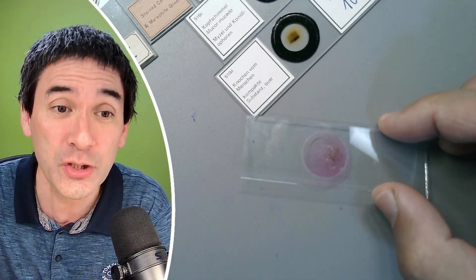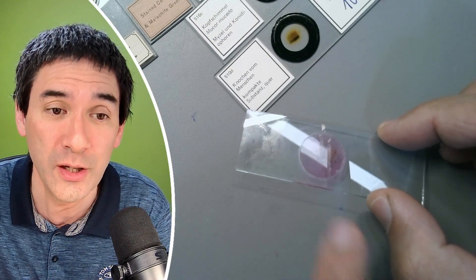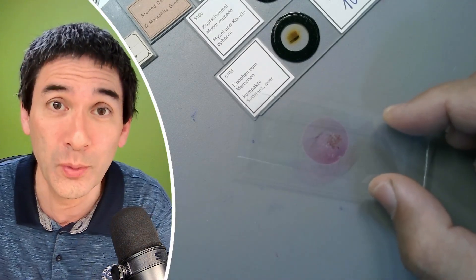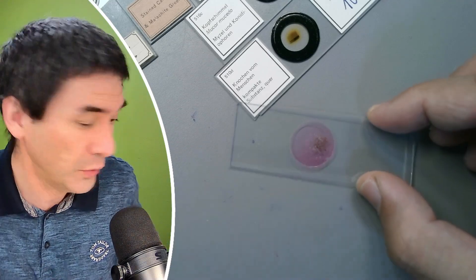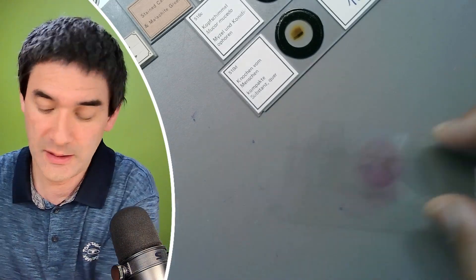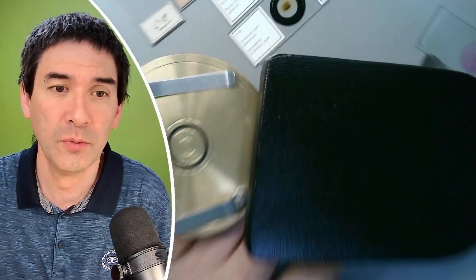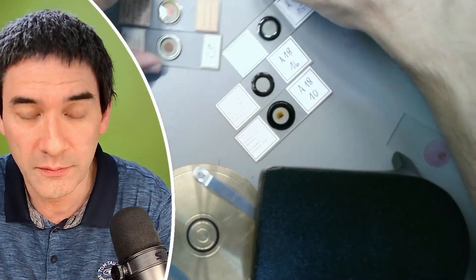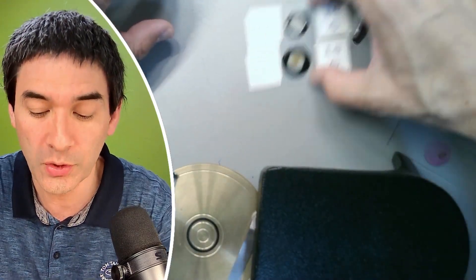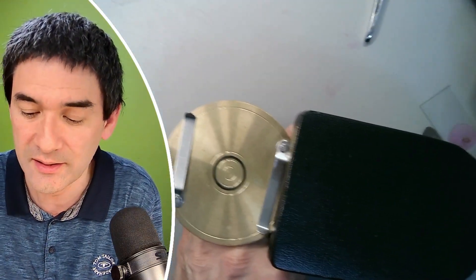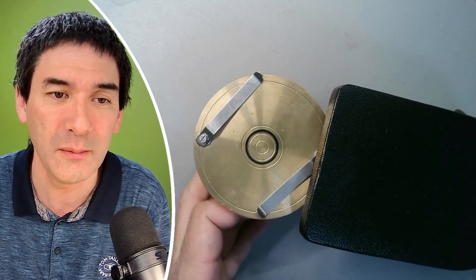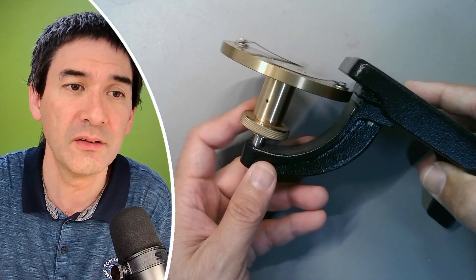So now, how do you actually do that? I would like to show you now how to ring this here. First of all, you need a slide ring table. Either you buy one or you make one yourself. I've got one over here. Let's move up the camera a little bit here. And let's put away all of the other slides here because I will be working with some nail polish. I'll just show it to you here from the side. You can spin this.